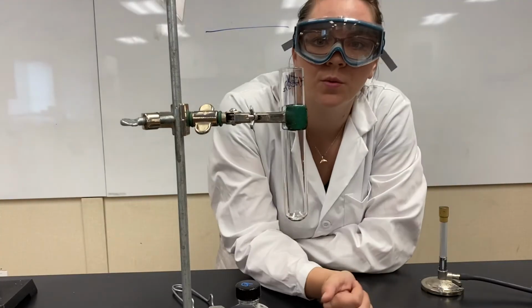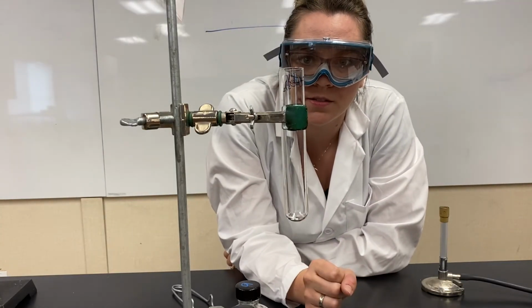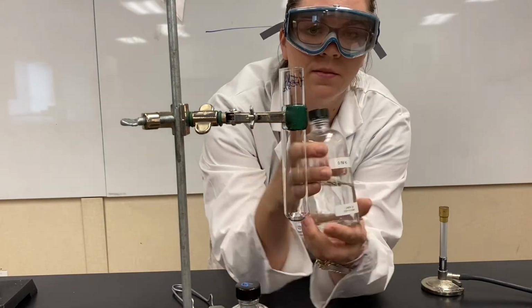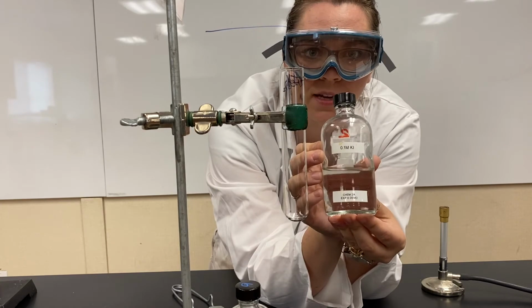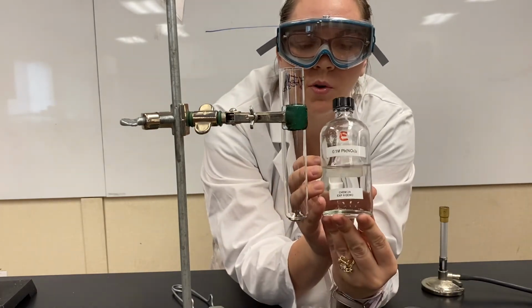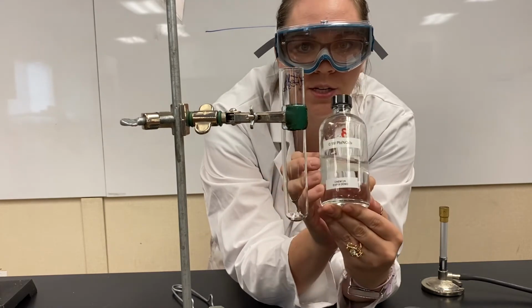All right, we are on to our double replacement reactions. So we have 0.1 molar potassium iodide that we are going to mix with 0.1 molar lead(II) nitrate.